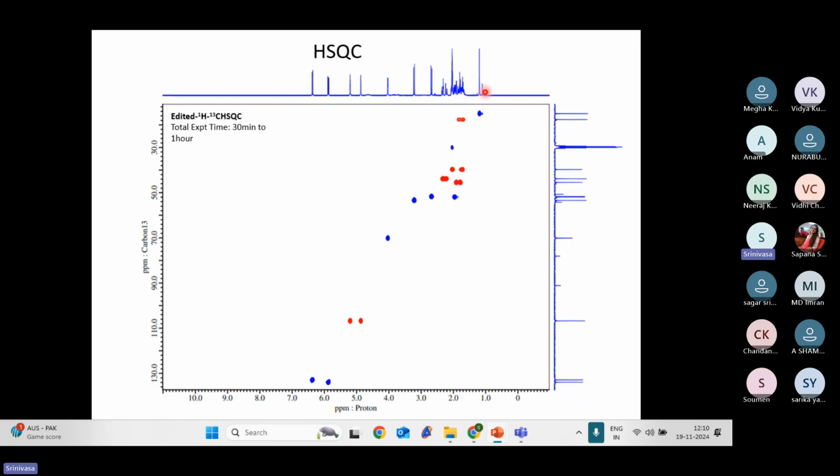Now, of course, sometimes the problem is that this peak and these contours are not matching. It's a mismatching, you call it. That has to be corrected. That's called referencing point, and maybe I will explain in the demonstration time. Now, see, make assignment. This peak gives a correlation to this. This is called the one. See, this may be the same. This proton and this carbon are coupled.